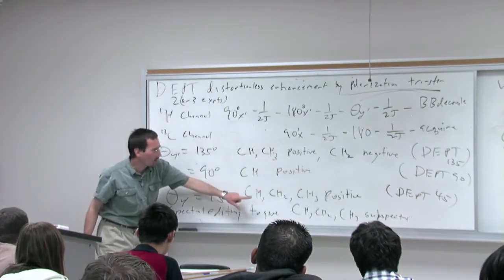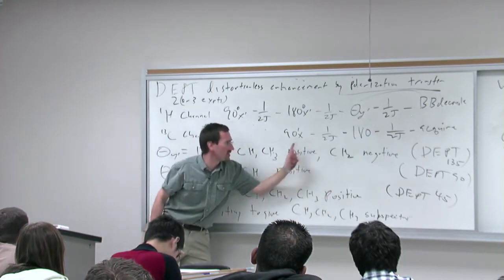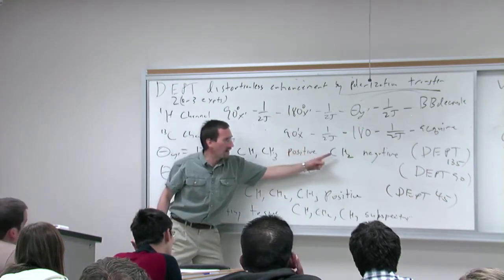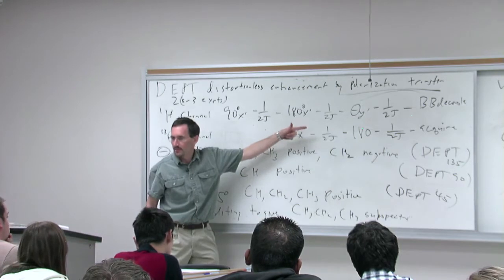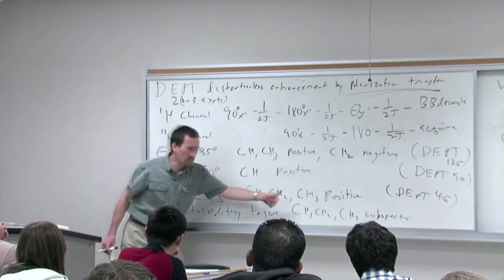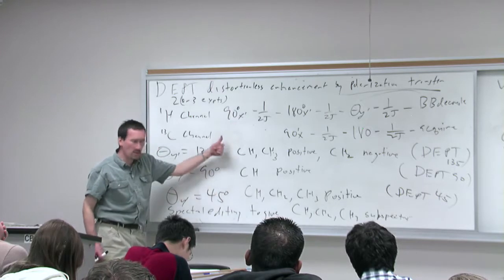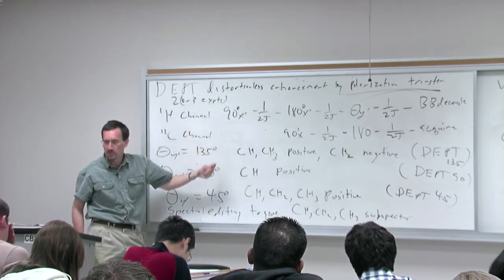Well, you subtract a positive number from a positive number, you get 0. You subtract a positive number from a positive number, you get 0. You subtract a negative number from a positive number, and you get a bigger positive number. So when you do that subtraction, you get a spectrum in which your CH2s are the only thing that shows up. You do other subtractions, you can get one that has just your CH3s or just your CHs.